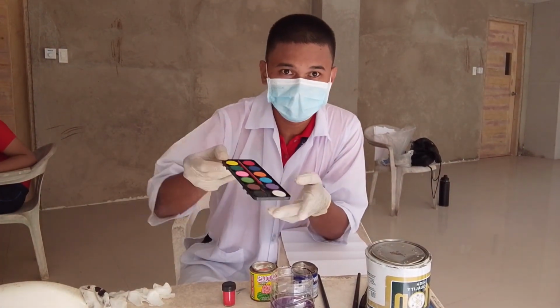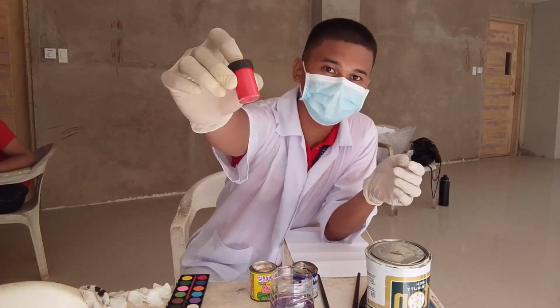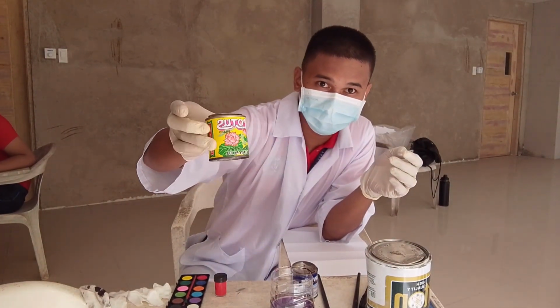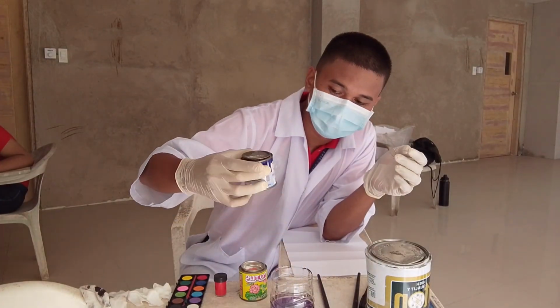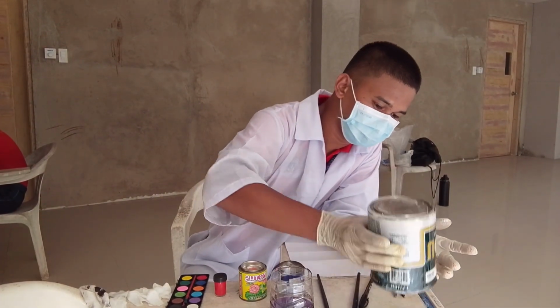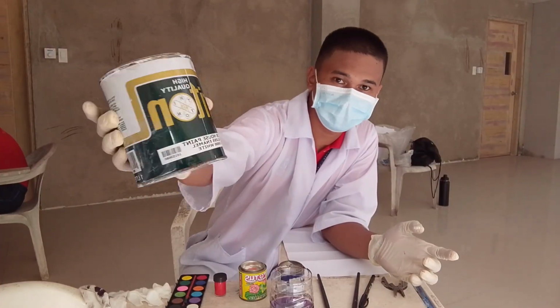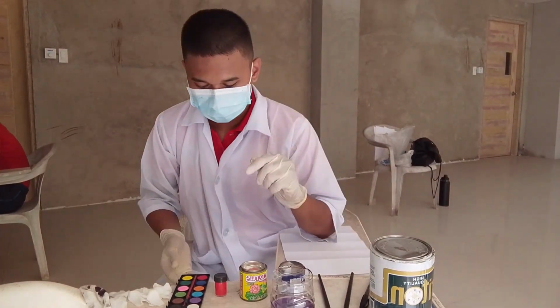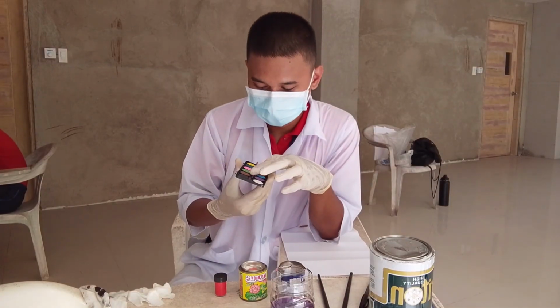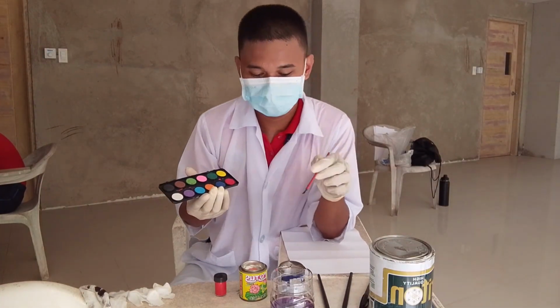the watercolor, the acrylic paint, the enamel paint, so I chose the Lotus brand. And oil paint, and I chose the Davis brand. And the semi-gloss paint, so I chose the Triton brand. Let me first examine the watercolor. I will first collect the sample.